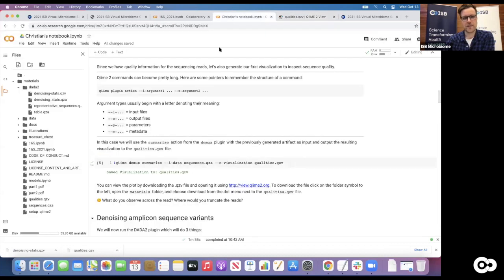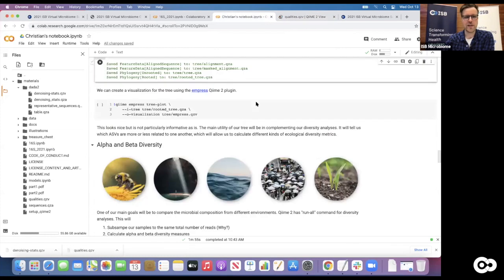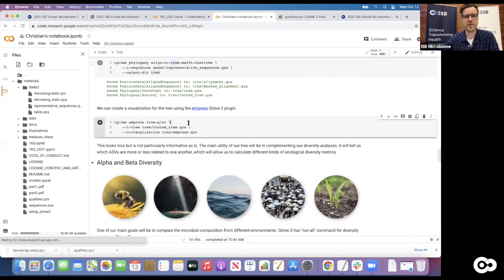So you can use the same tool to look at how long your reads run. Usually, your sequencing unit should know, because that's part of the protocol they use. They know by default what the target length is that the sequencer goes for. But definitely, if you get data from a collaborator, they might not be super sure, and it's always good to check. They might tell you it's 250 base pairs and you look at it, it's only 100, right? That happens. Stuff gets mixed up, and that would be a good analysis here.